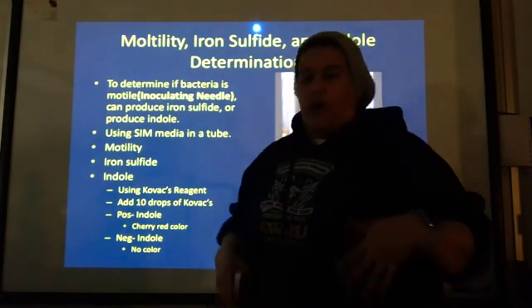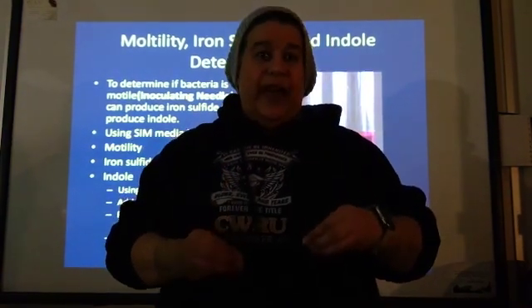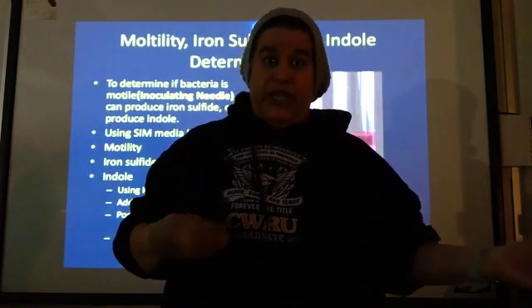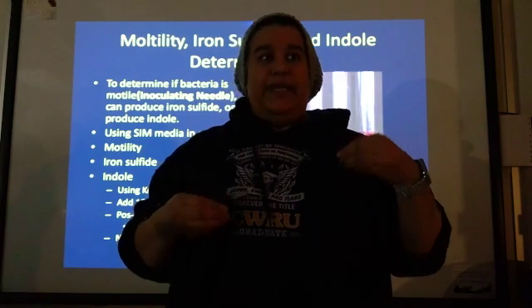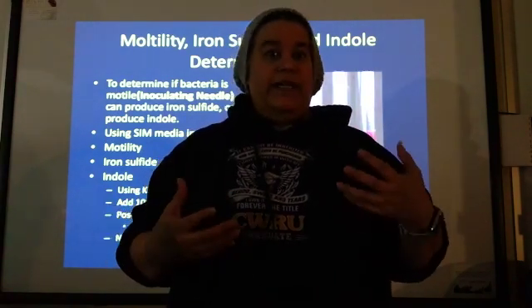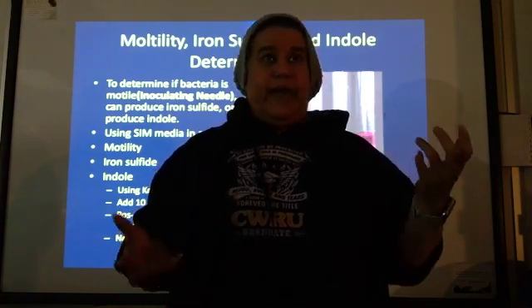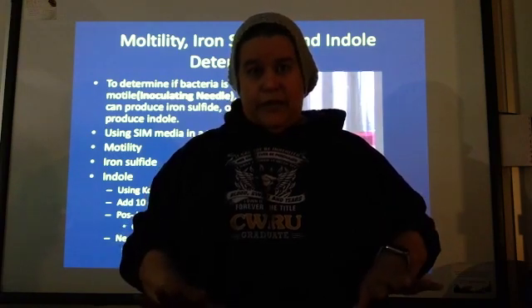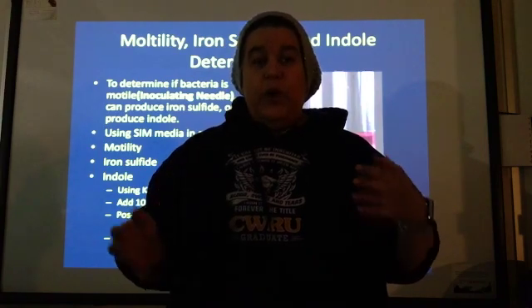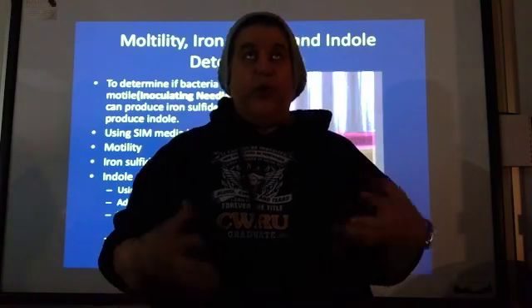These tests are, again, a way to narrow down which bacteria you have, because every bacteria is different as far as what it can digest, what it can't digest, what it can react to, like the hydrogen peroxide, what it doesn't. Is it motile? Is it not motile? Is it able to produce indole? Is it not? All of these clues will help you when it comes to your unknown bacteria at the end of the semester or toward the end of the semester.